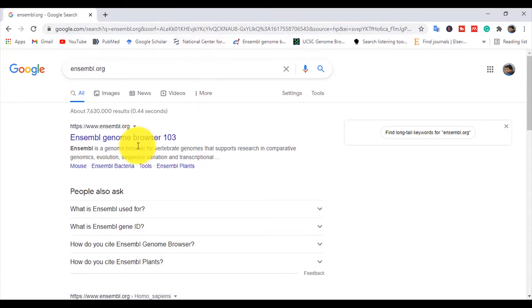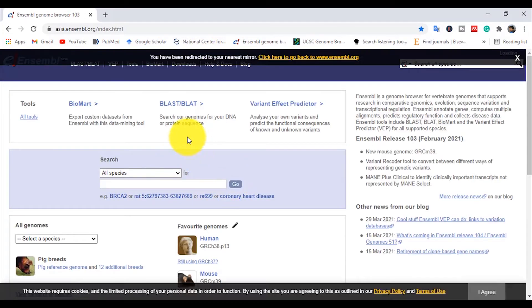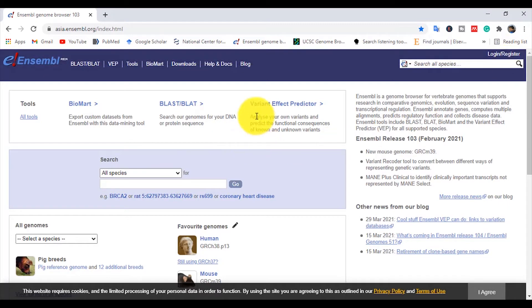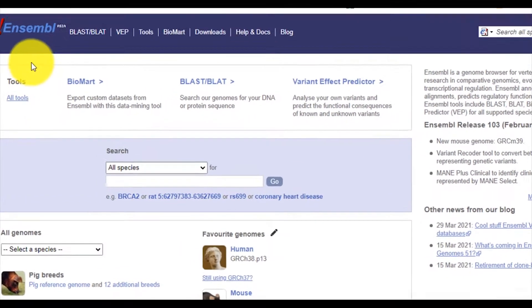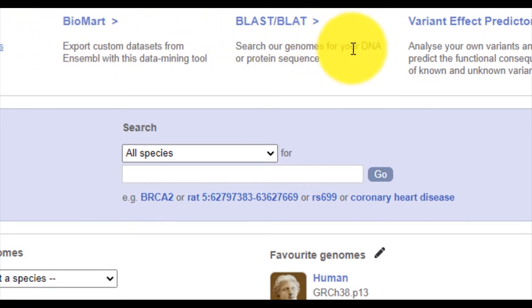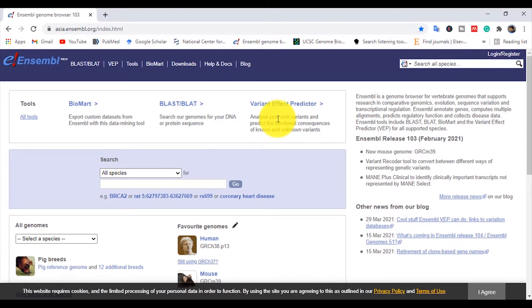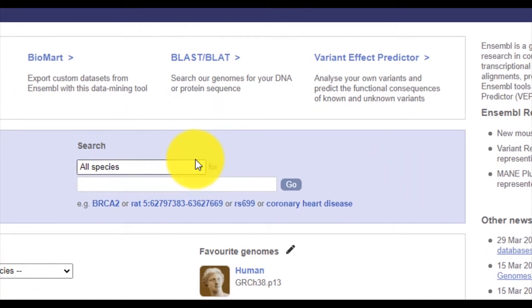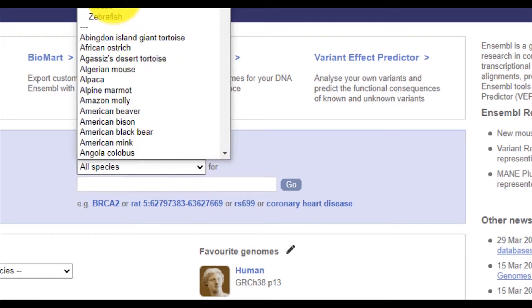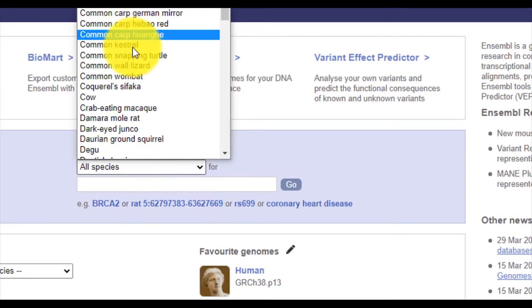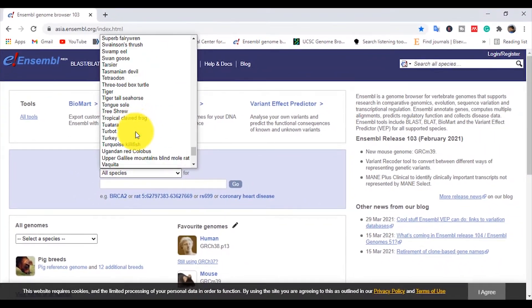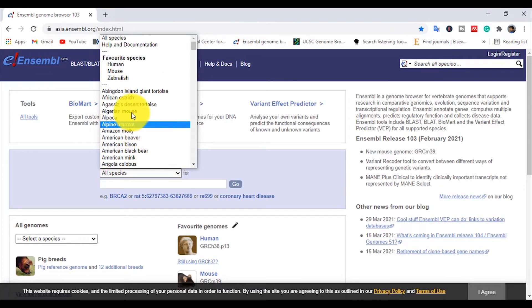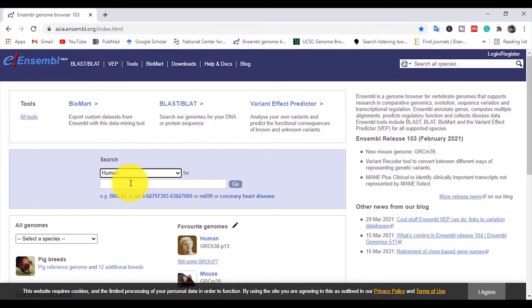After searching, click on the Ensembl genome browser. You can see many tools such as BioMart, BLAST, and Variant Effect Predictor. First of all, you will select a species relevant to your research. This website has all the gene sequences, genomic variations, and transcriptional regulation of many vertebrates. I will search a human gene.